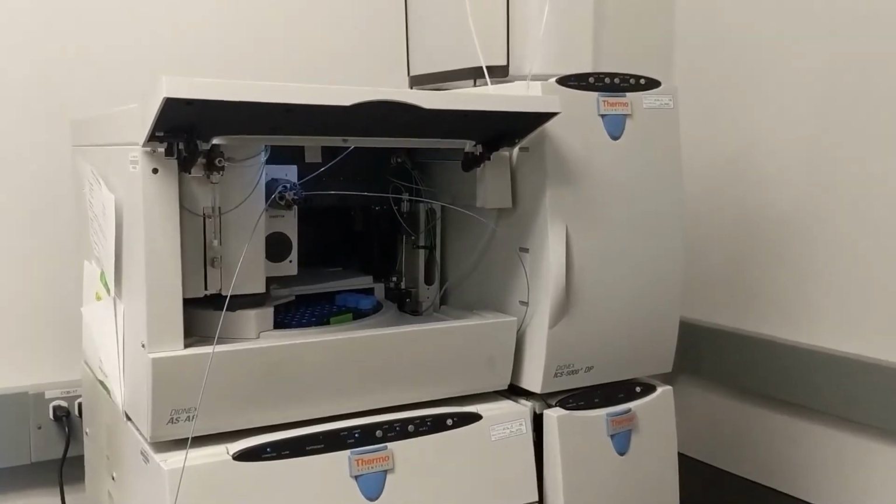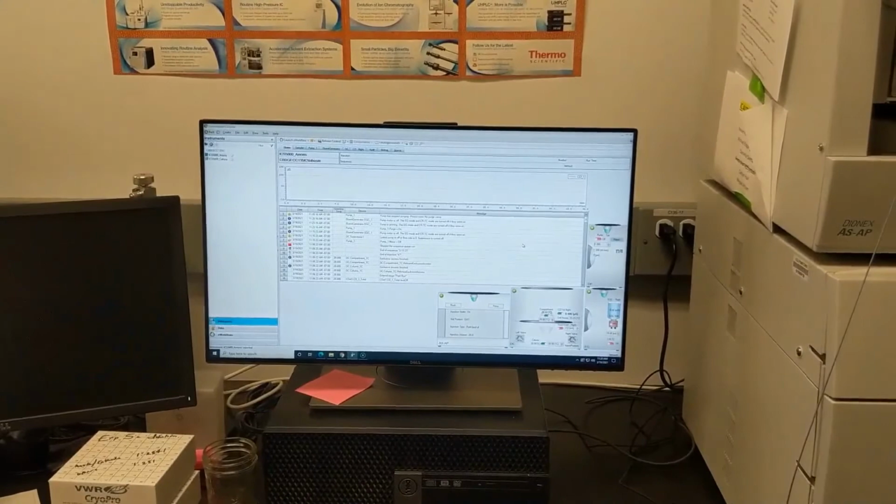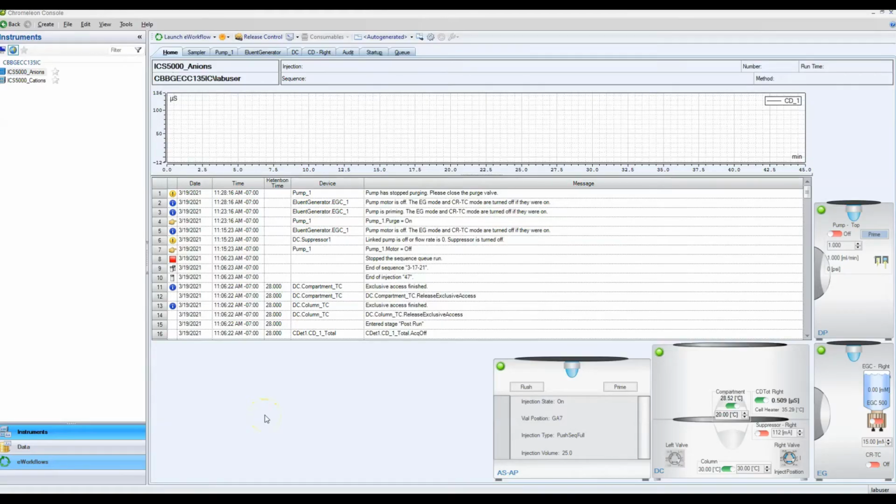Our pumps are primed, our bottles are filled, and we are now ready to look at the Chromeleon software. So let's dig into it. Alright, so welcome to the Chromeleon software. So here's the home screen for the Chromeleon software. You can see that we have 3 main tabs right down here. They are Instruments, Data, and eWorkflows.